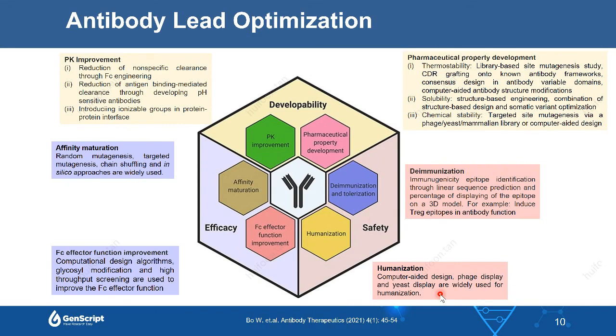Computer-aided design allows the user to construct 3D homology model structures, analyze the structures, and design mutations in silico, and phage display and yeast display allow them to physically assess all possibilities to determine whether a mouse or human amino acid residue should be selected at each testing position.